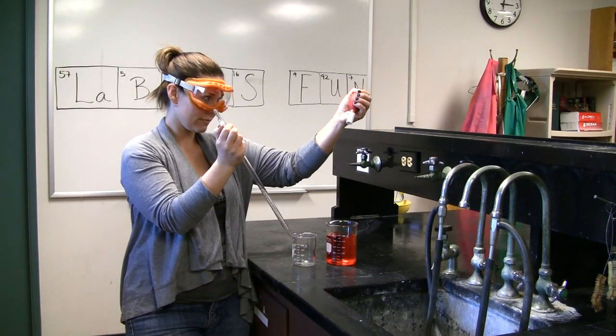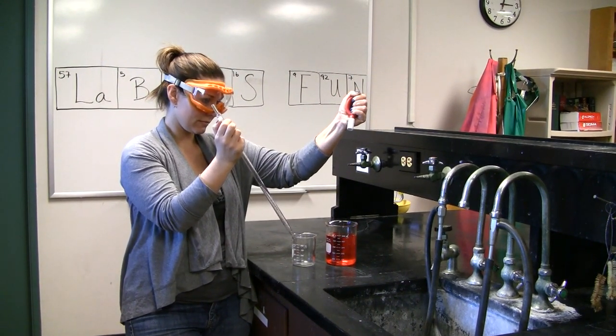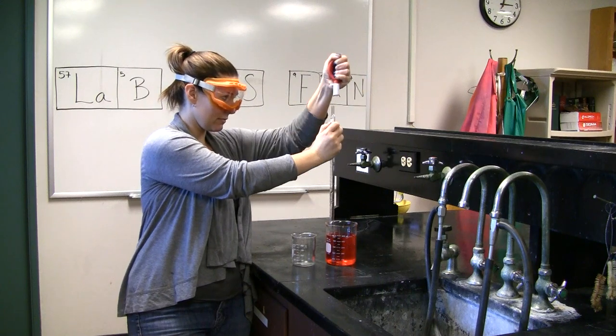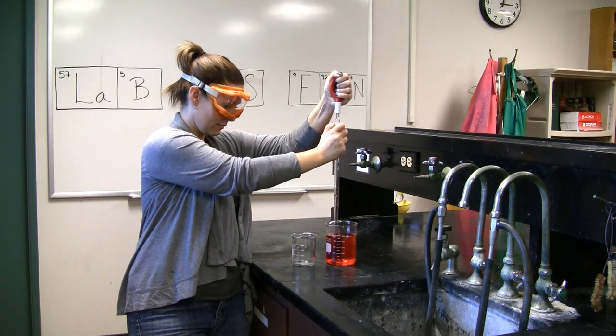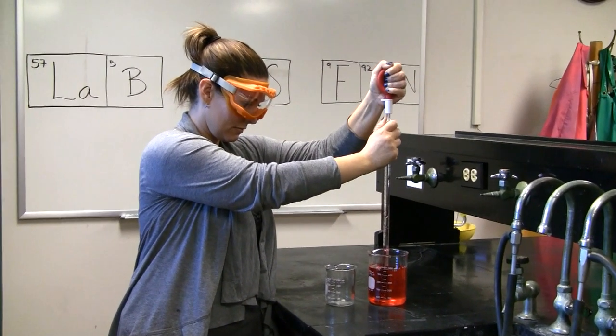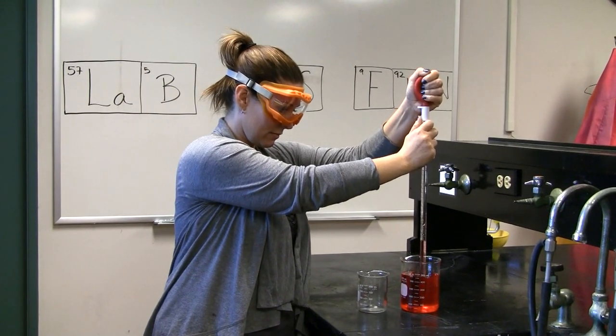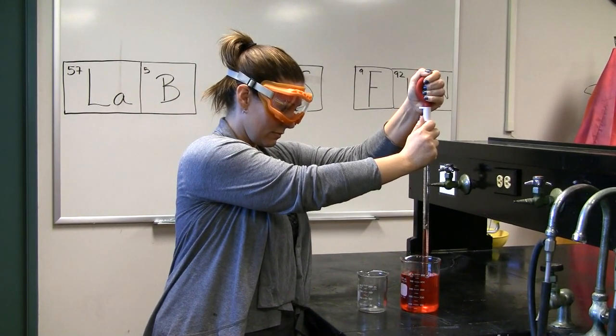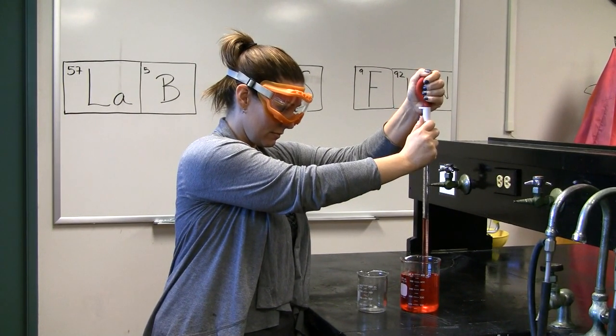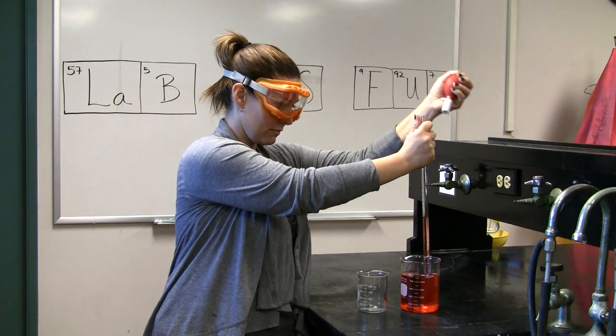First, squeeze the bulb to remove the air. Rest the bulb gently on top of the pipette. You do not need to jam the bulb on top. It simply rests against the pipette to make a seal. Release the bulb slowly to draw liquid into the pipette. Do not allow the liquid to splash up into the bulb.